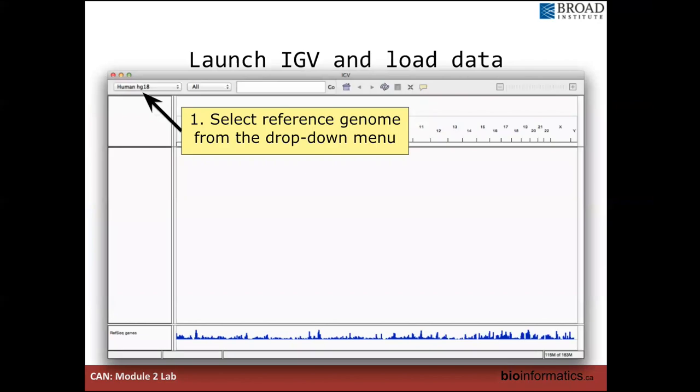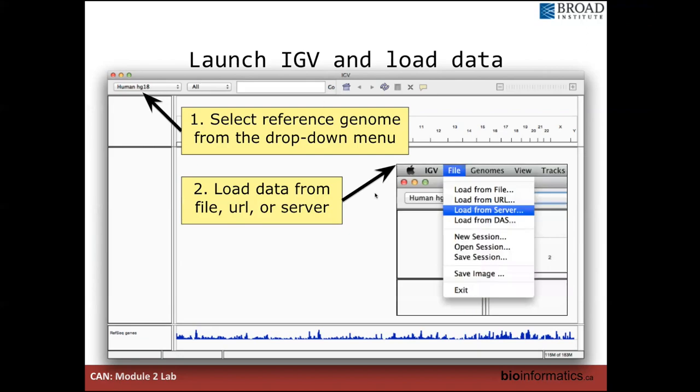So once you launch IGV, you should see a screen that looks like this. The first thing you want to do is make sure you have the correct reference genome selected. So this is a pretty old screenshot here. At the very least, you should be using HG19 if you're working with humans. If you don't have the correct reference genome, everything is going to look very wrong. Your alignments are going to look terrible. And from here, you can then load your data, again, as I said, from a file on your computer or from a URL or server.